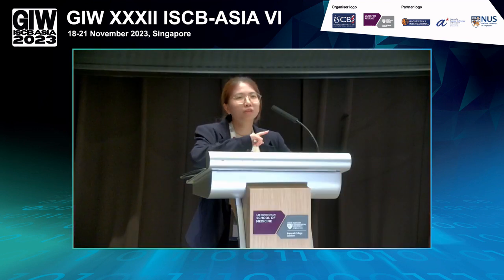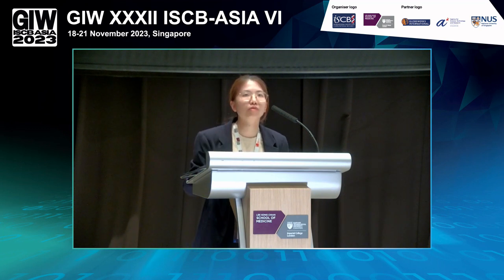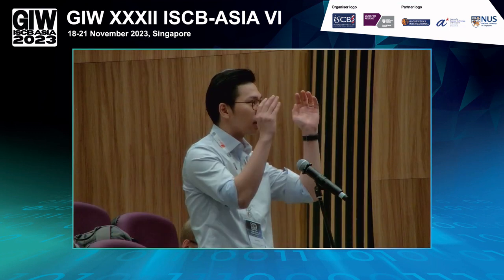Hi Felicia, really nice talk. I think it's a non-technical question. Have you tried to time the entire process and how much it speeds up the whole process? Let me think. When I ran the full data set, that's 300,000 cells, I think it took about 40 minutes for the whole process for all the 4 different plots to be generated. But the one that I realized took a lot of time was the t-SNE. My question is really on the workflow level: without the Shiny app, how long would that take, and how long would the whole process take with the Shiny app? I think that would be a really interesting thing to test. I think we should go and measure that as well, but definitely faster.